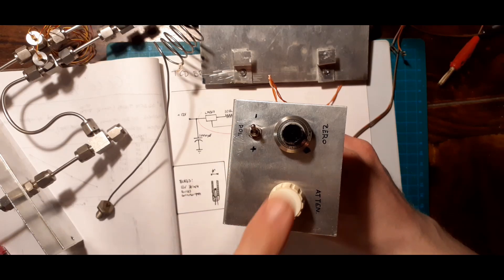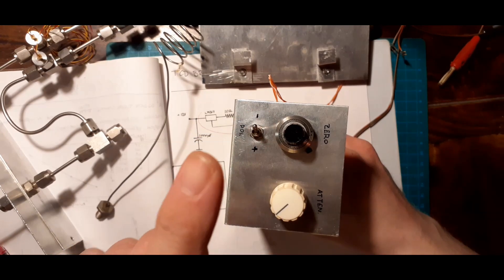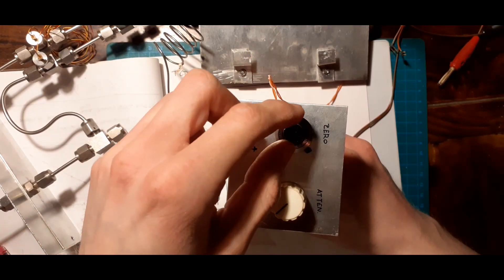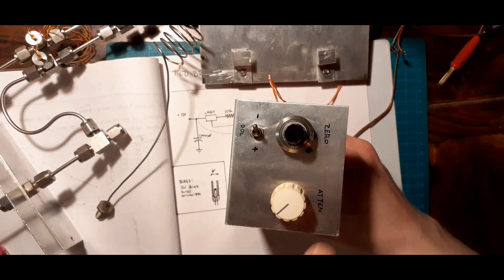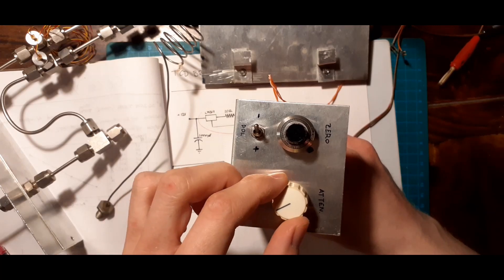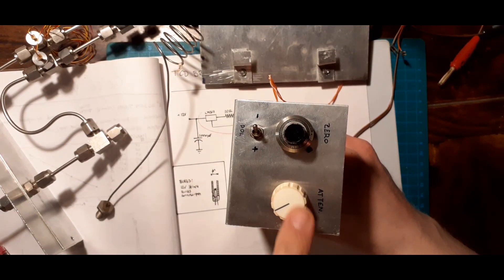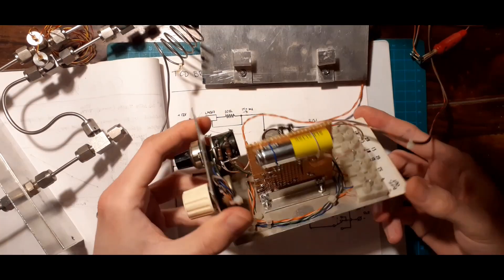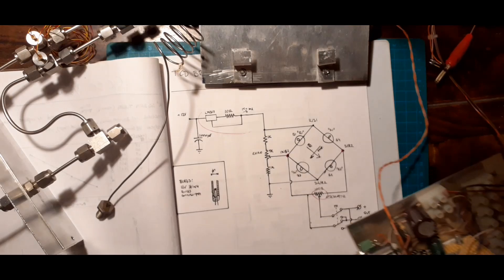Remember, what you're really detecting is the difference in thermal conductivity from helium. So any analyte that wicks heat better than helium will give signal one way, and any analyte that wicks heat more poorly than helium will go the other way. Usually they will all wick heat more poorly. But it's nice to be able to switch polarity, since I don't have a bipolar power supply for this, and I'm feeding it into a 0-5 volt microcontroller ADC. And you can see the switch configuration here. As you'll see here, more circuitry. There's a battery. There's a little chip.